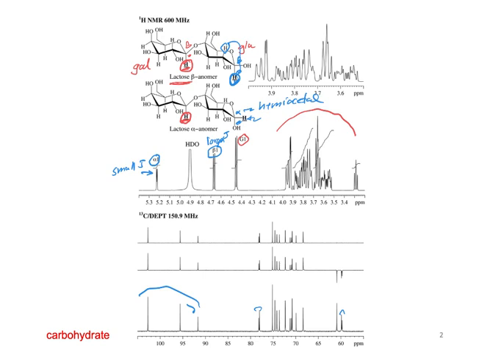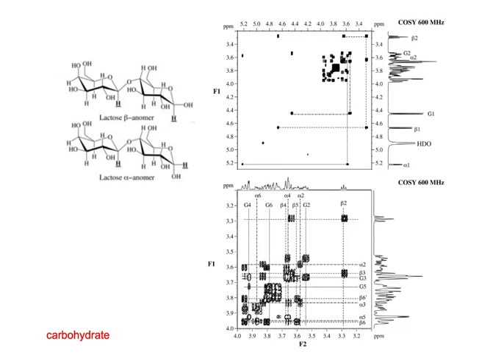All right, so part of the challenge here is to try to have some technique so we can separate these enough to be able to see what's going on. So that was alpha. All right, so here's the normal COSY. I think this is the double quantum filtered COSY.